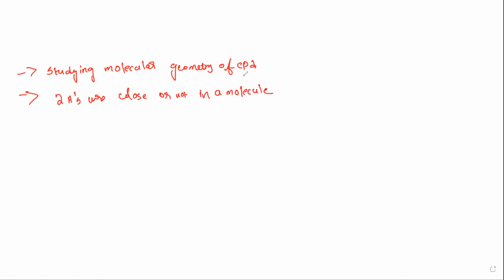One limitation of this method is that the line intensity observed in the normal spectrum may not be the same as in the decoupled spectrum. This is the limitation of this method.